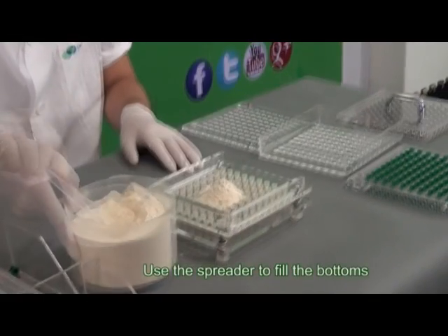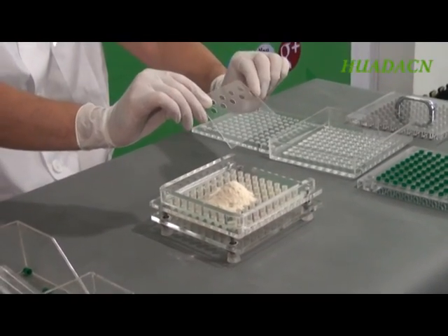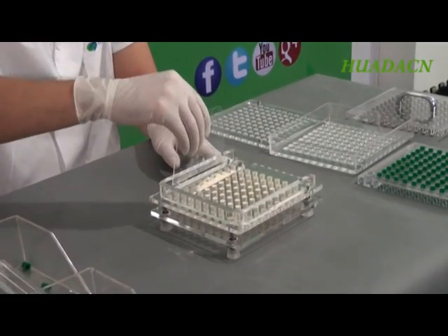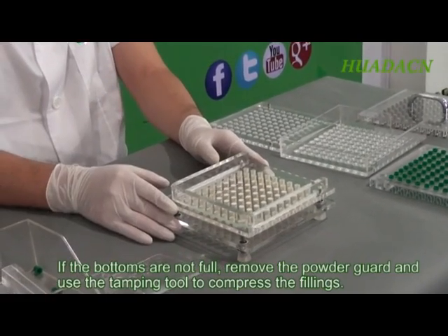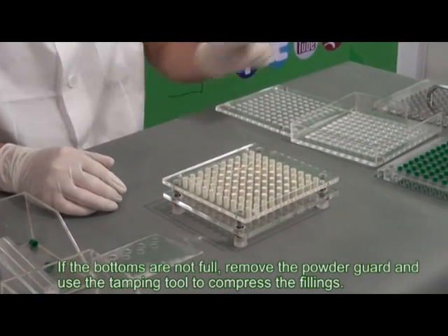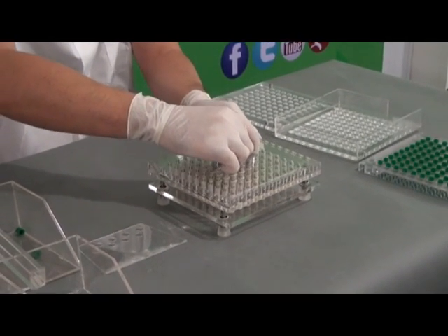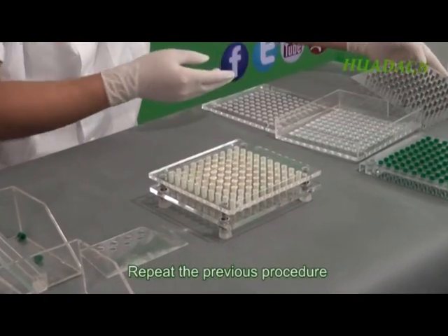Use the spreader to fill the bottoms. If the bottoms are not full, remove the powder guard and use the tamping tool to compress the fillings. Repeat the previous procedure.